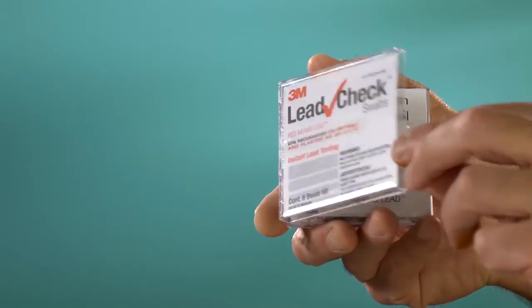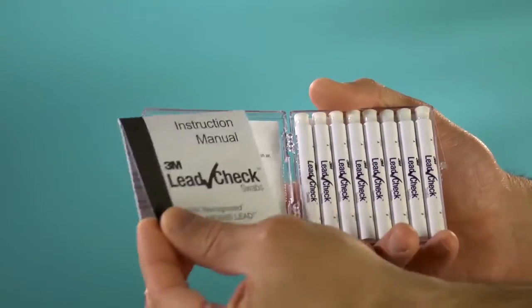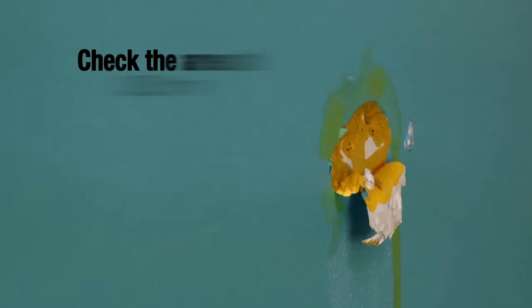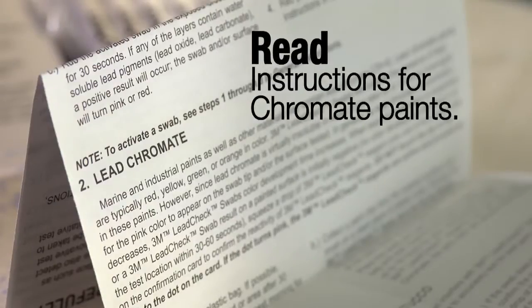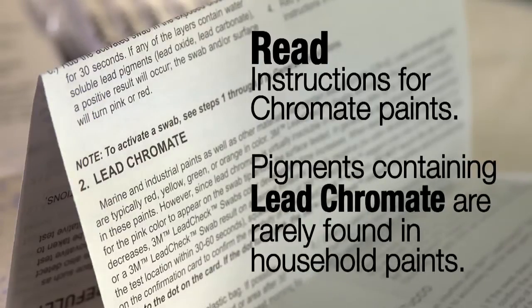Testing some industrial paints requires longer development time. Make sure to check the area at 30 minutes and again at 1 hour for red color development. Read the instructions regarding chromate paint in your instruction sheet for more information. Pigments containing lead chromate are rarely found in household paints.